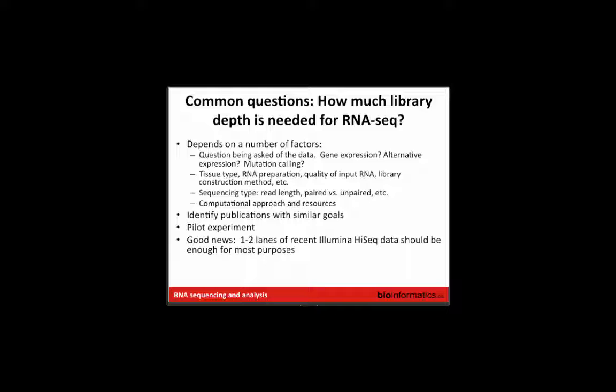Somebody else asked, if the sample is degraded and you don't have enough data, but you still have the sample, is it common practice to add another lane and aggregate the data so you have enough data? People do tend to compensate for bad sample quality by producing more data.